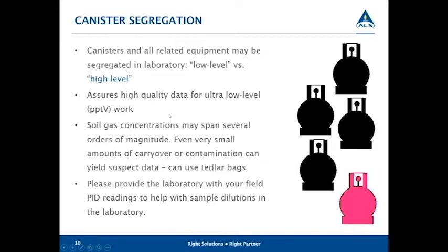If you're requesting SIM or ultra low level analysis, part per trillion reporting limits, we need to make sure that we are using canisters that are low level and that have not had previous high levels of VOCs in them. So those cans are segregated within the laboratory to assure that we have a high quality of data for ultra low level part per trillion work.